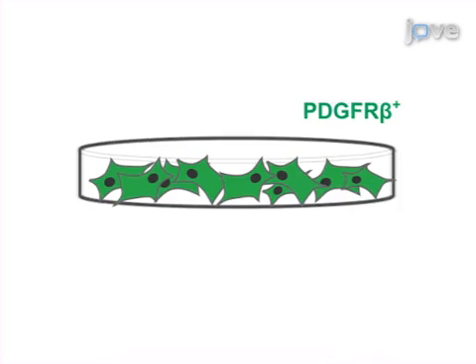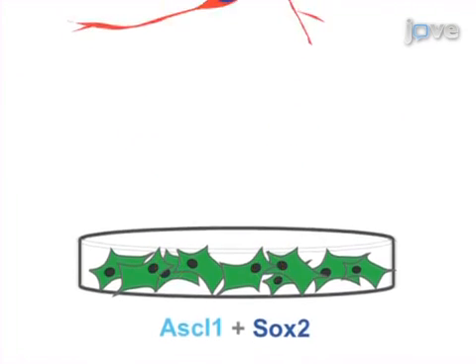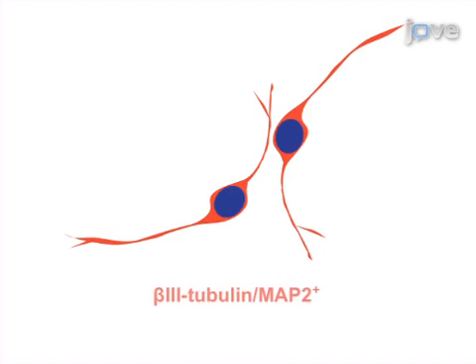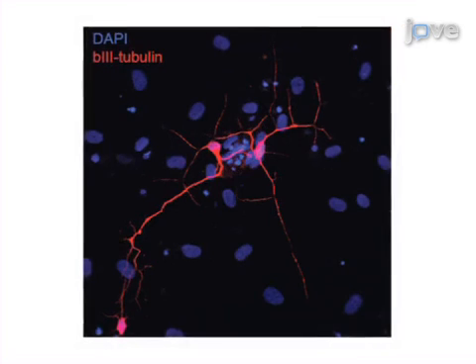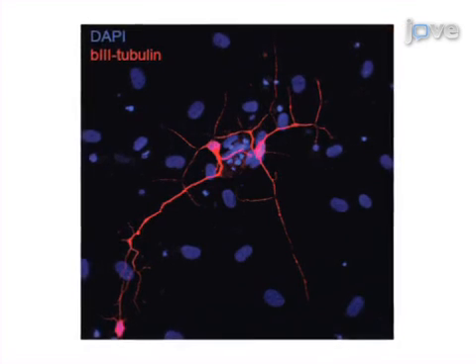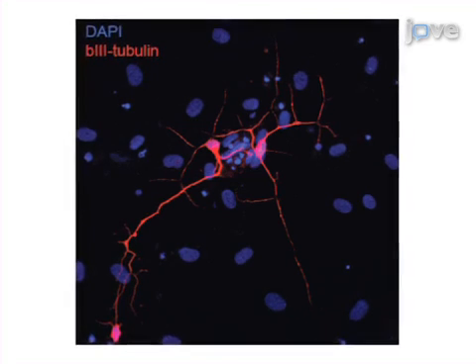of the cells. Then, pericyte-derived cells are transduced with retroviral vectors encoding neuronal fate determinants in order to directly convert them into induced neurons. Results are obtained that show induced neurons obtained from lineage-reprogrammed pericyte-derived cells based on immunostaining for the neuronal marker beta-3 tubulin.